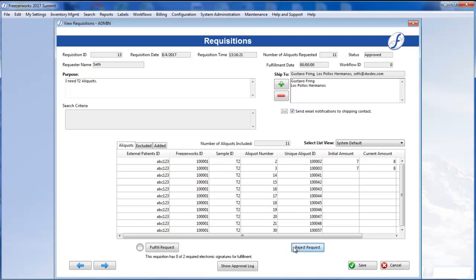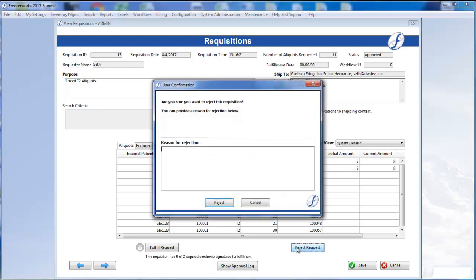So, I'll click Reject Request, and a confirmation will appear where we can provide a reason for the rejection. For my example, a higher priority request has come in for the same aliquots.